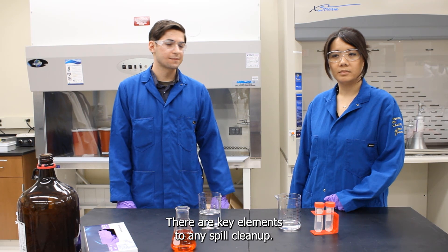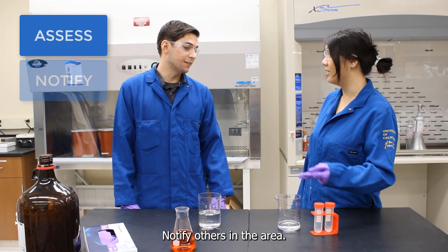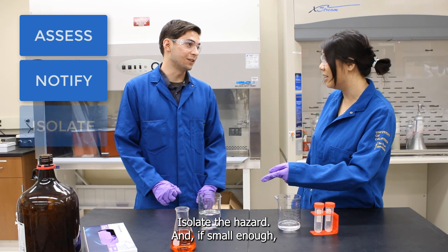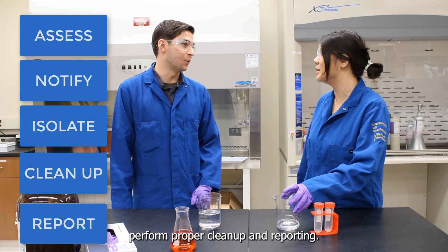There are key elements to any spill cleanup: assess the situation and ensure personal safety, notify others in the area, isolate the hazard, and if small enough, perform proper cleanup and reporting.